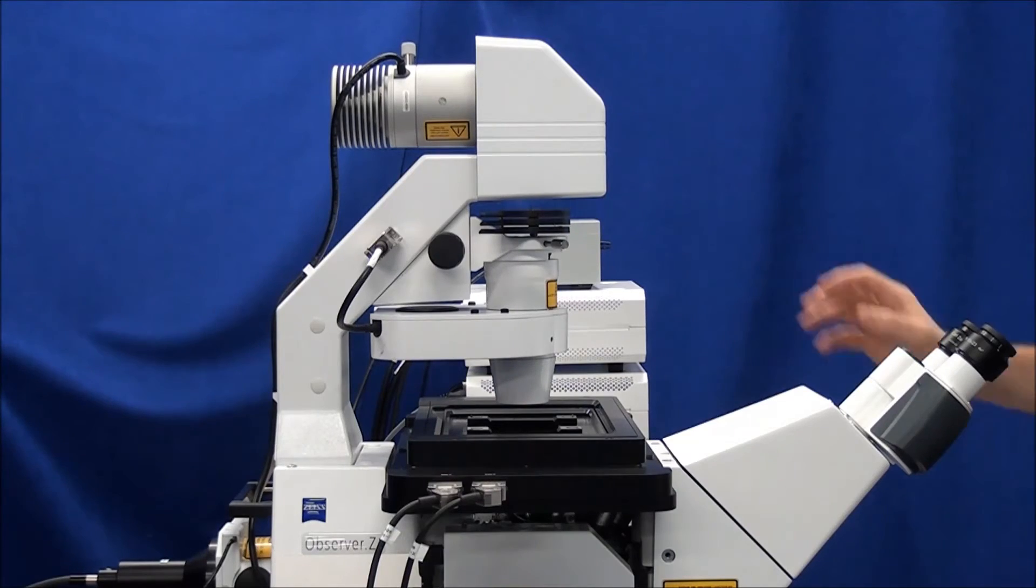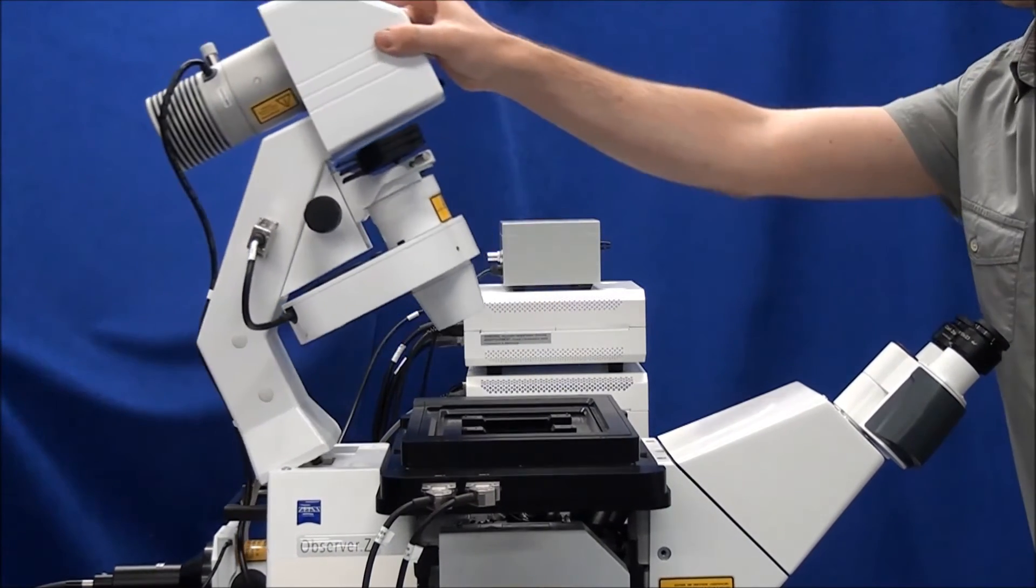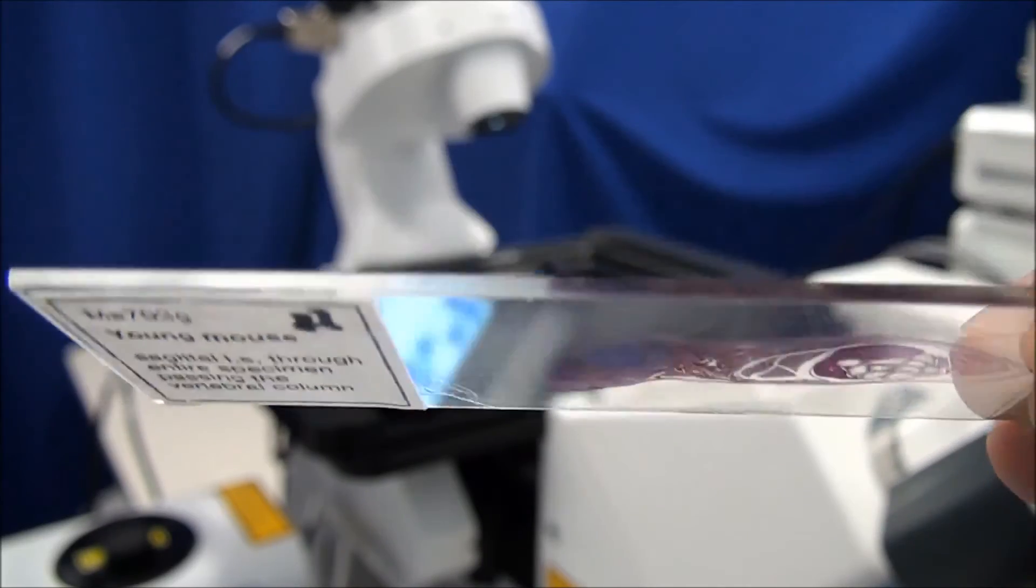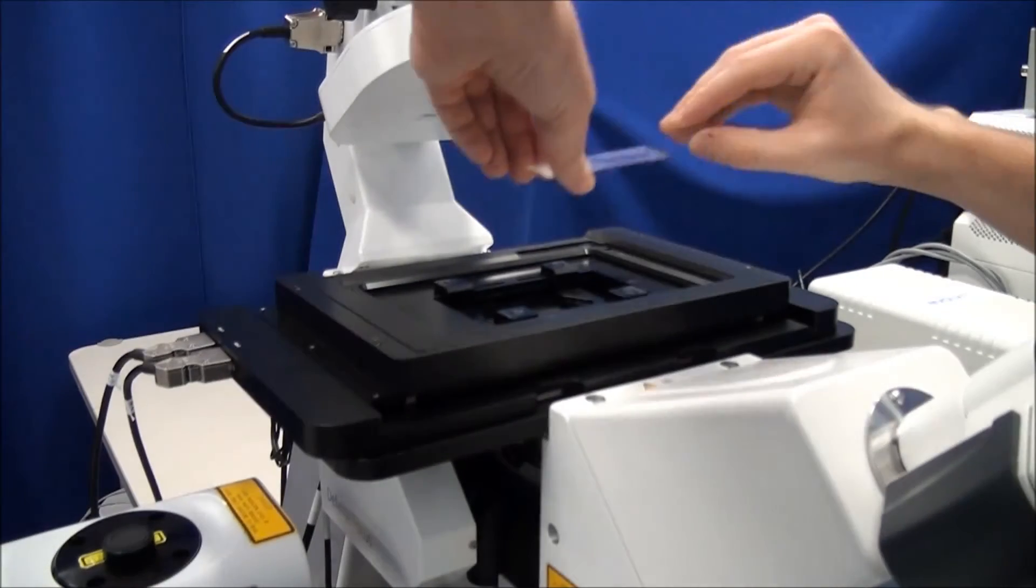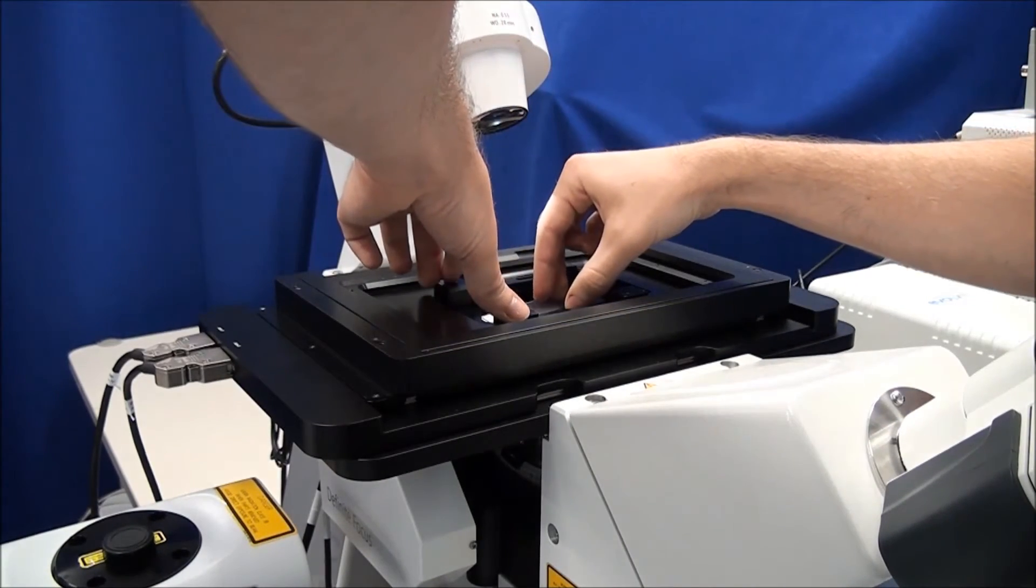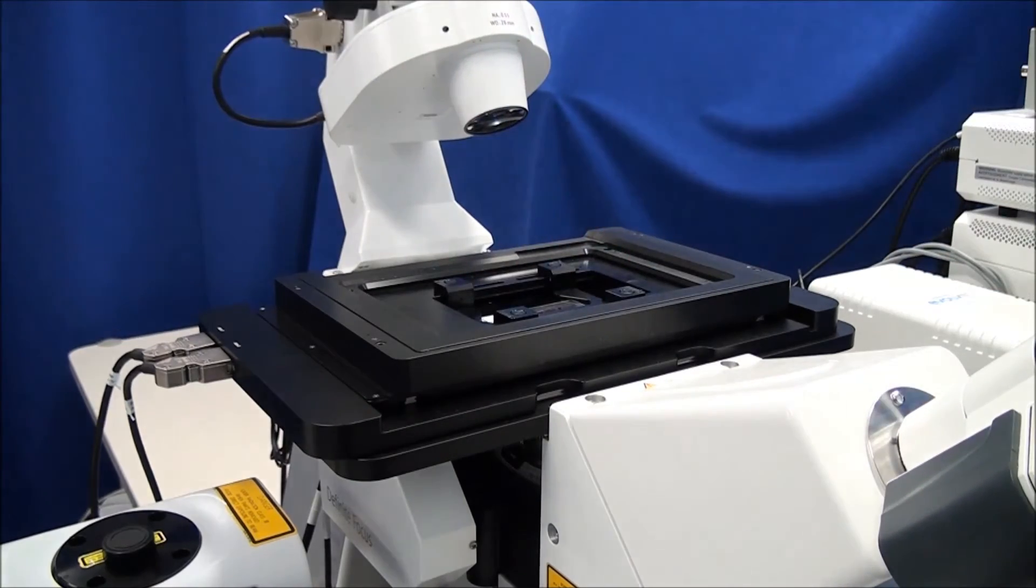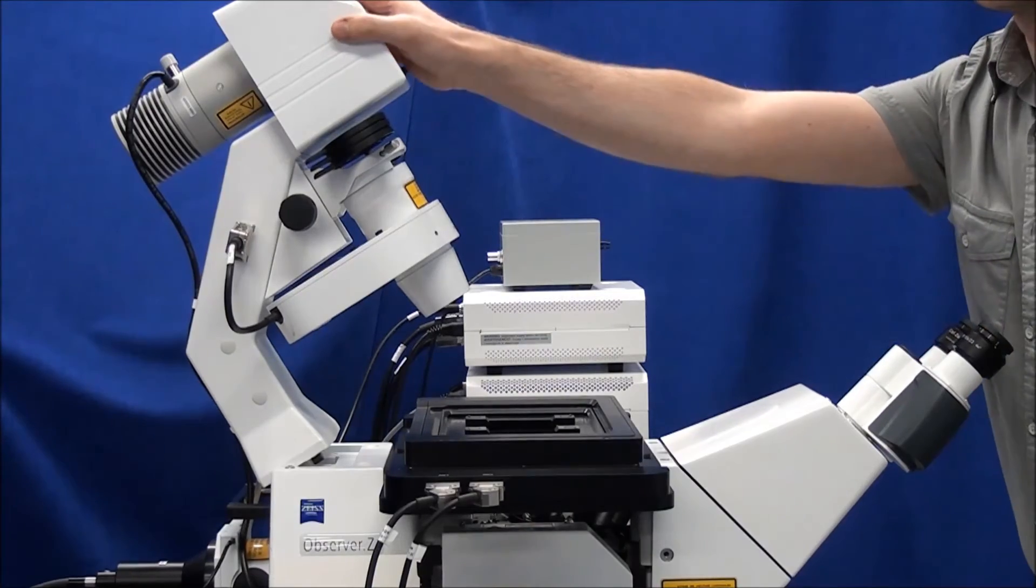Tilt the transmitted light arm backwards to the stop. Place your high contrast stained specimen slide face down on the stage. The cover slip should face towards the objective. Tilt the transmitted light arm back down into place.